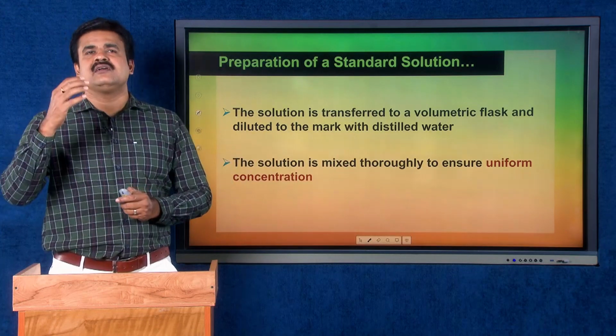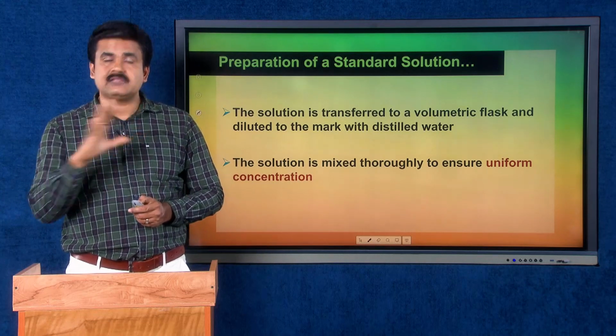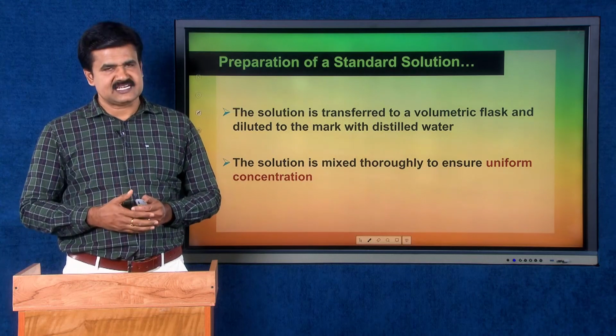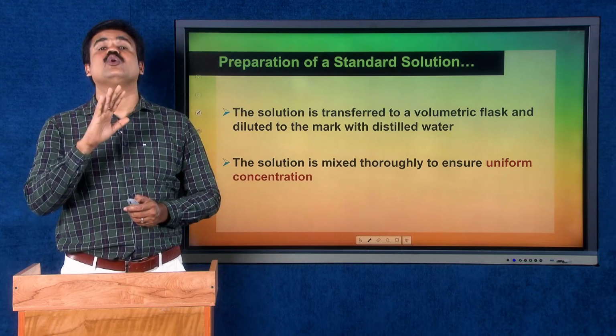The solution, finally, you have to mix it very thoroughly. So, this thorough mixing enables uniform concentration. That is, the solution should be homogeneous.